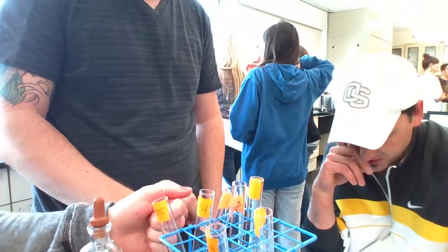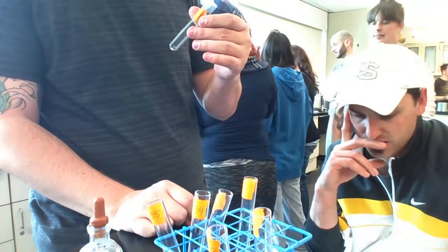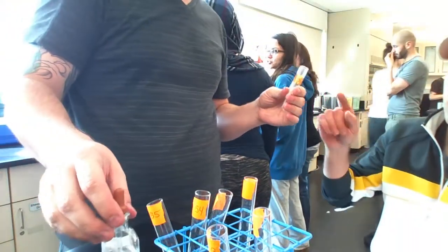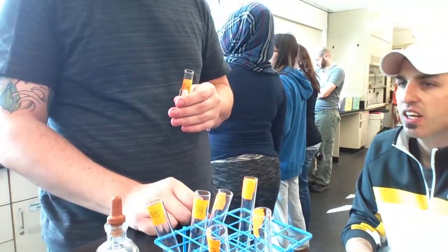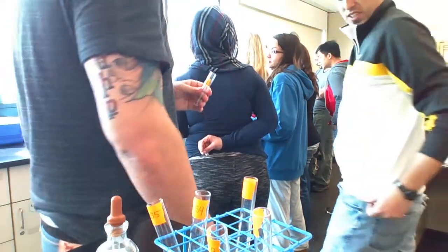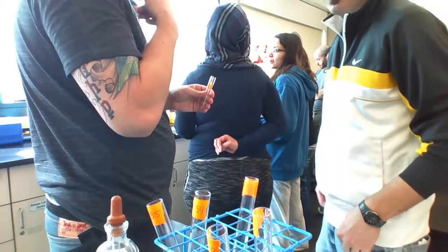So when you pick it up, there's number 2, it's going to have 5 drops of lipase, and then 2 should get 5 drops of litmus. Okay, so we're still good? So this one's 5 drops of water. Well, I think the litmus cream goes in first. So litmus cream will go in everything except for one. One should be done now, because we got 5 and 5, right?